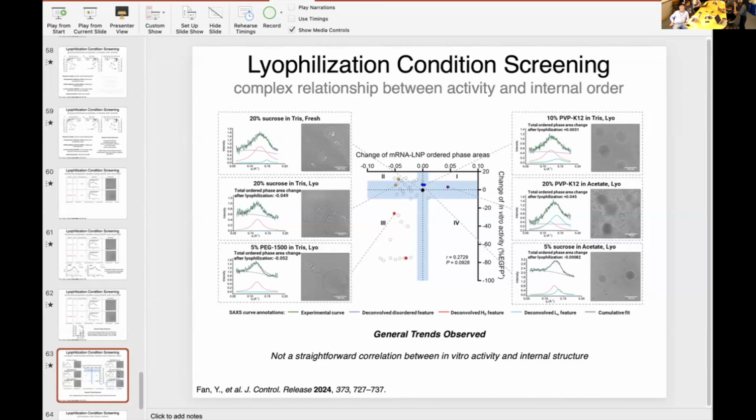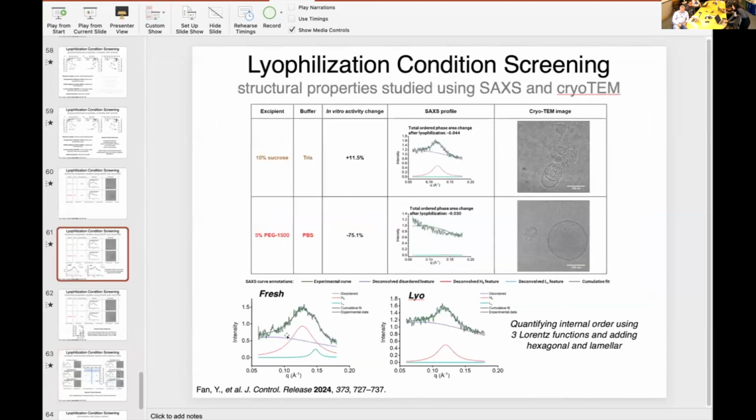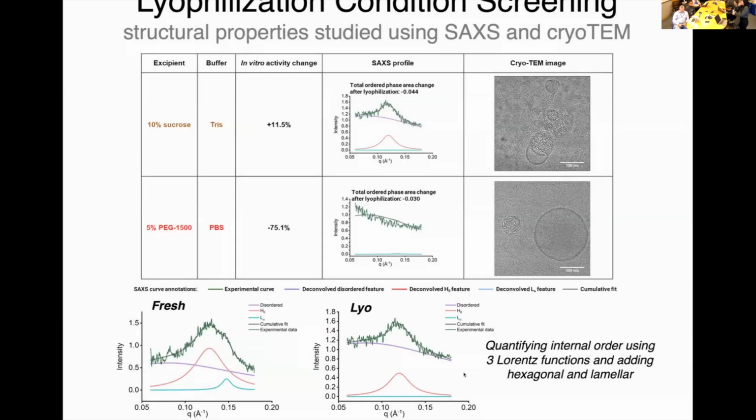And that strong peak obviously is from the organization of the lipid layers, right? So nice, different organizations within the LNPs. It kind of helped that I saw the shoulders again, like in this case, for example. So it helped to identify that there was a second peak phase. And then also, I do notice some distance changes, because previously it was the antisense oligonucleotides and these are mRNA. So the distance of the peak, where the peak centers are located, does also shift.